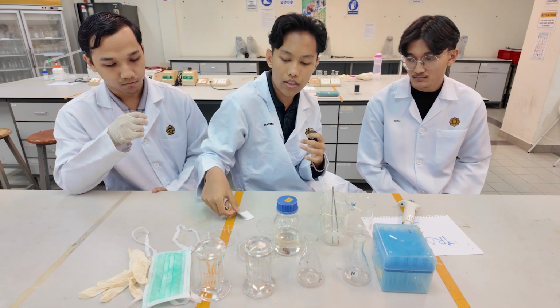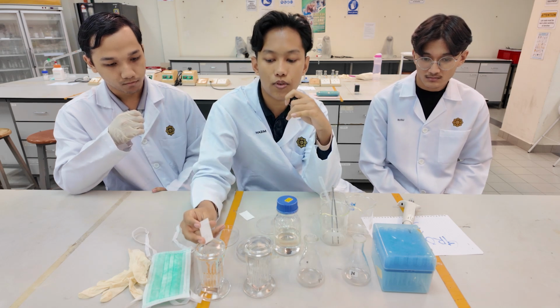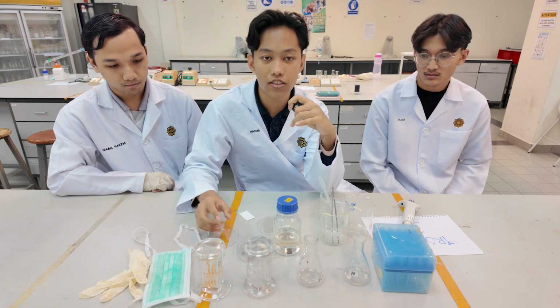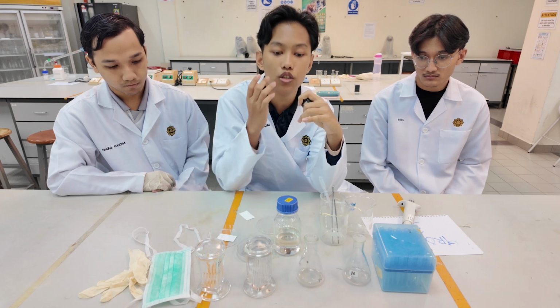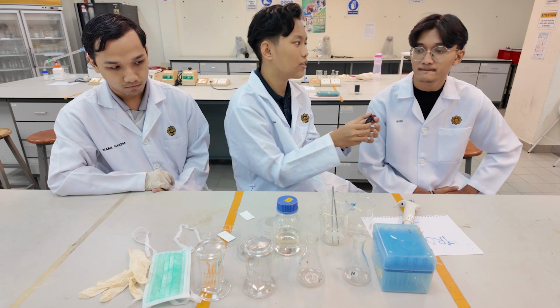We do this for each of them. We put it in and let the solvent rise for about 1 minute. Then we take it out and let it dry. After it is dry, we can use a spectrometer to read the data and take it. Okay, done.